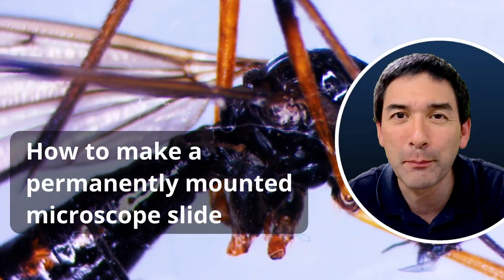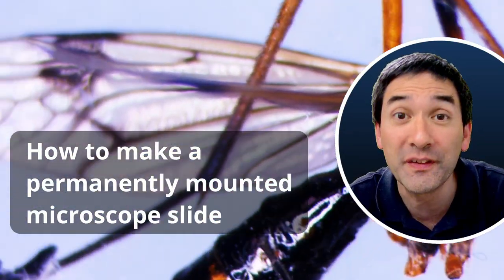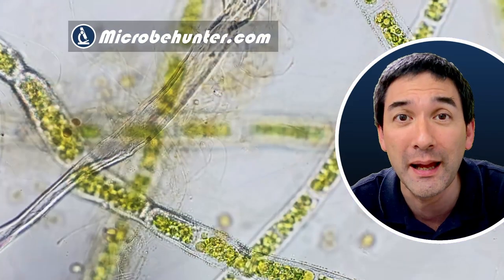In this video I'm going to show you how to make permanently mounted slides of an insect which I found and also of some algae.